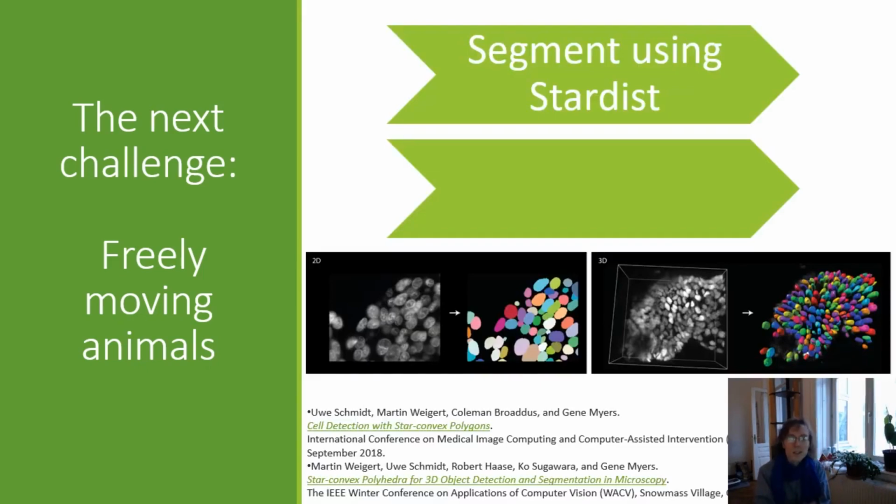So I'm super excited to talk about the computational solutions that we have for this challenging problem, and begin with a lot of the wonderful tools that have been published already in the neuron analysis community. Specifically, we start by segmenting and detecting our neurons using a trained version of StarDist, which you can see here works quite well for neurons and separating them from both their neighbors and from background.